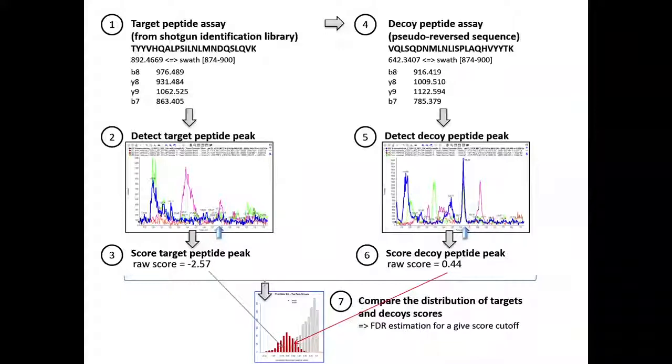I think this might come up. Personally, I never remove the non-proteotypic peptides from the library, although we have different concepts even within our group. In principle, those are peptides that may come from 10 proteins. Even if you quantify it, you might not know where it's coming from. But from the identification point of view, you can still identify it.